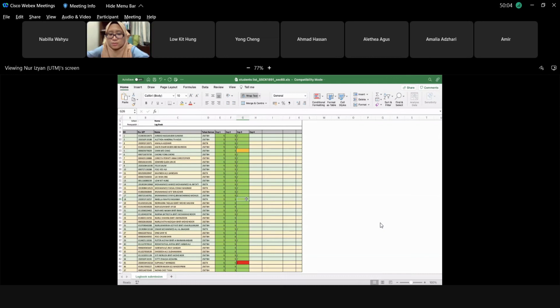From. Okay, continue. Your initial statement is correct. To prevent hazardous substance from entering. I give you a hint. Entering the hazardous fine particle. We want to prevent it from entering.